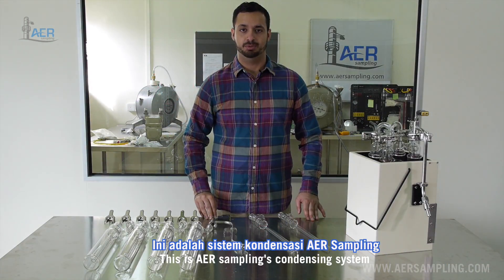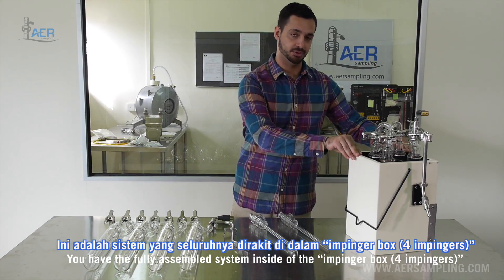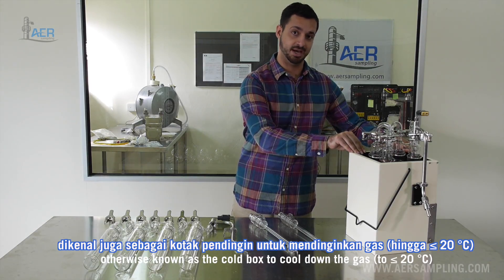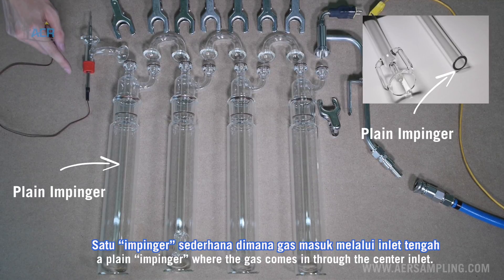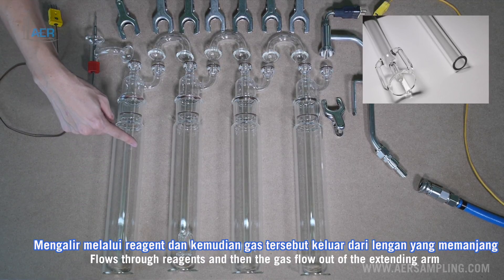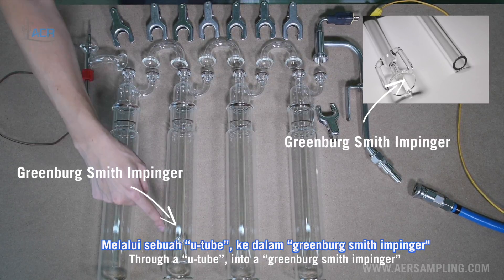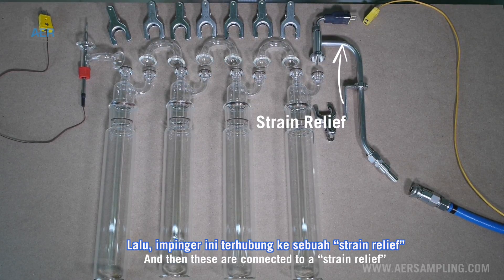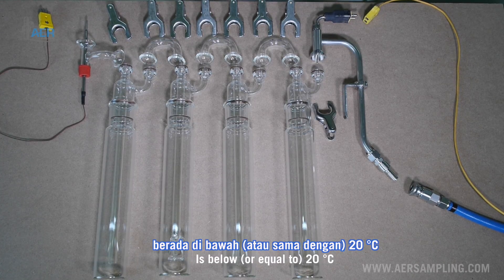This is AER Sampling's condensing system. We have the fully assembled system inside of the impinger box — otherwise known as a cold box — to cool down the gas. Inside the box we have four impingers: a plain impinger where the gas comes in through the center inlet, flows through reagents, and then flows out of the extending arm, through a U-tube, into a Greenberg-Smith impinger, and then out through two more plain impingers. These are connected to a strain relief with a thermocouple to ensure the temperature of the gas flowing out is below 20 degrees Celsius.